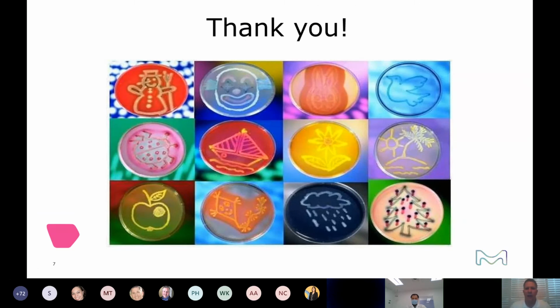And I always end my slides with this little microbiology. You'll notice these are the months using microbes on chromogenic medium.